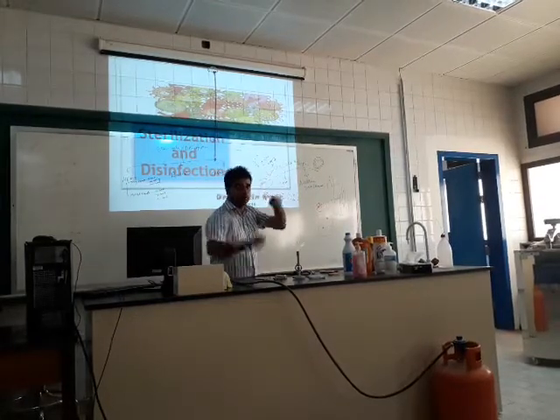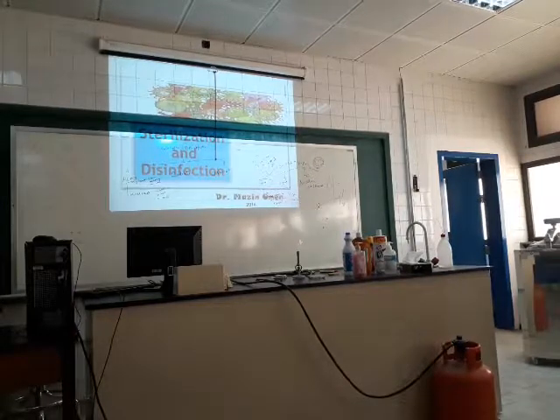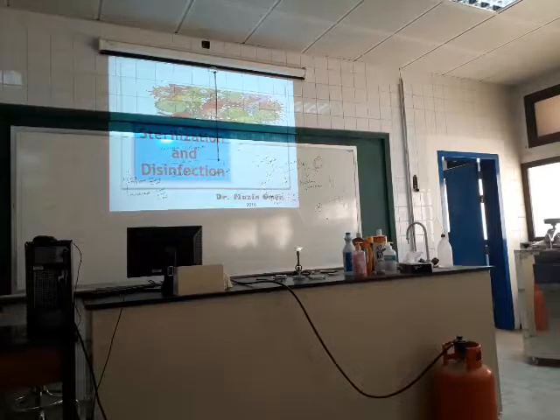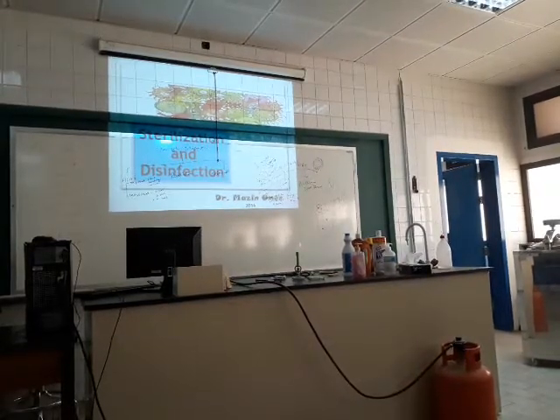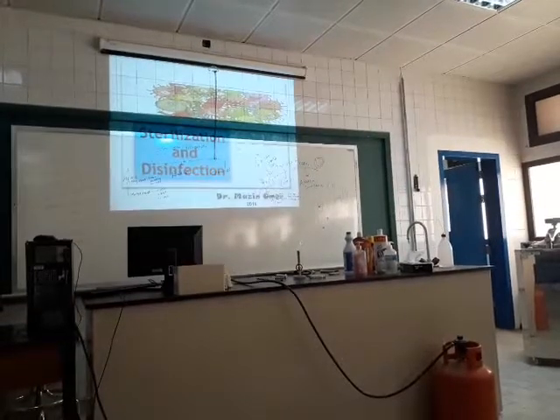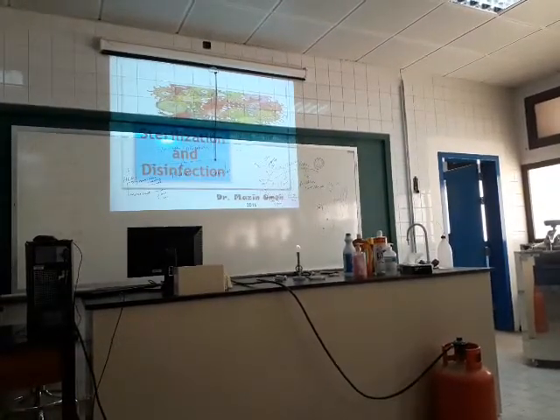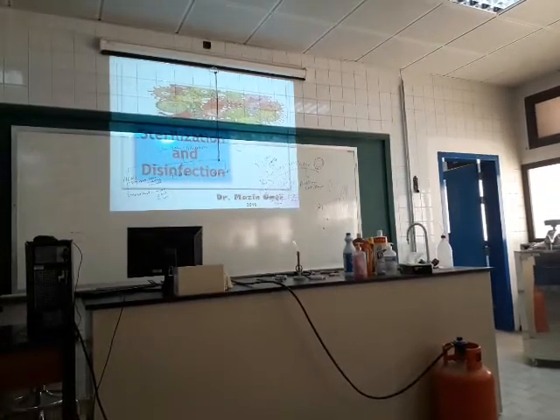One method, okay? Now another method. Maybe this will come in the pictures that will come. This is another heating machine. No, not autoclave, do not be confused. This is called a hot oven. You set the temperature to maybe 160, 180 degrees.